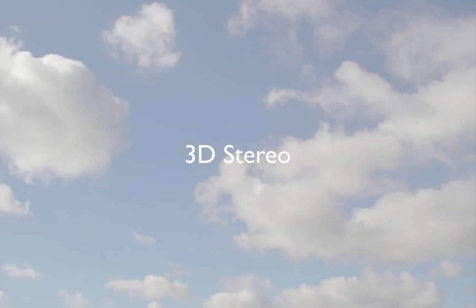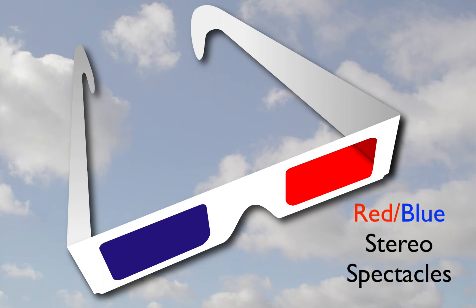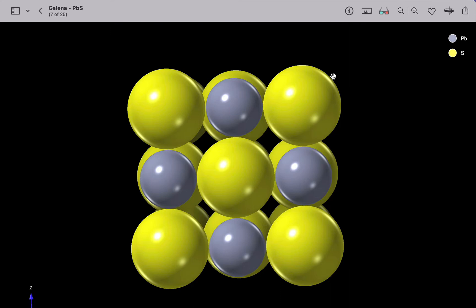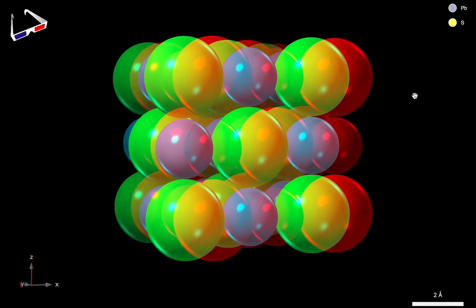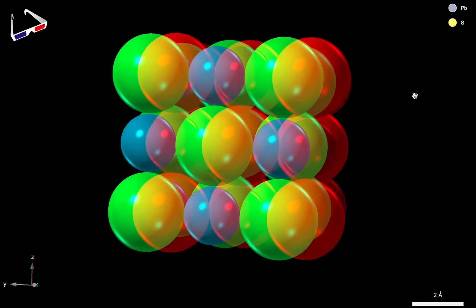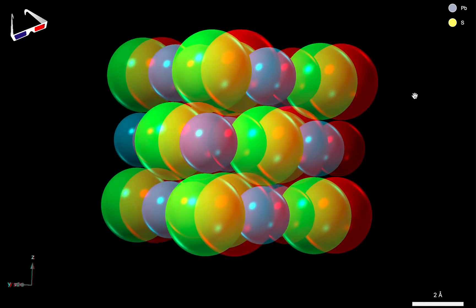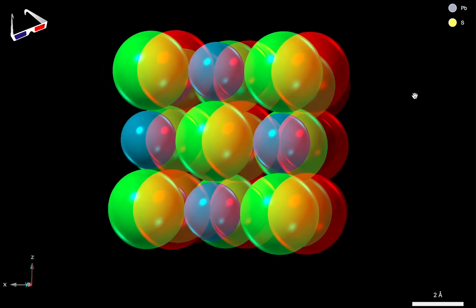Now you'll get a much better sense of depth using True 3D. And for this you'll need a pair of red-blue stereo spectacles. Let's explore. We can enter the 3D viewing mode by clicking the Stereo button in the toolbar. We now get two different views of the structure superimposed. These correspond to what each eye would see, but they've been tinted red or cyan. And your red-blue glasses will filter these images so that each eye only sees the correct image. You'll still get a colour image though, and it can look really impressive, especially if you rotate your image. This helps to relax your eyes.